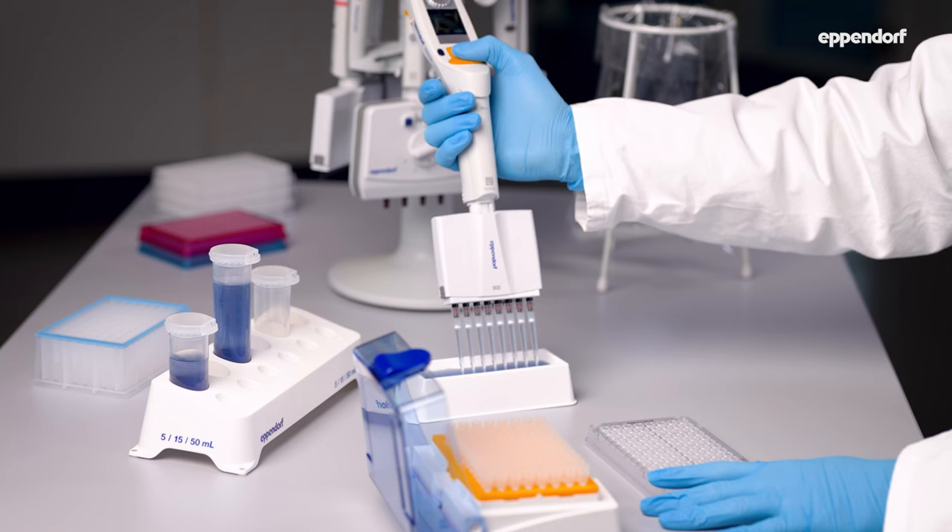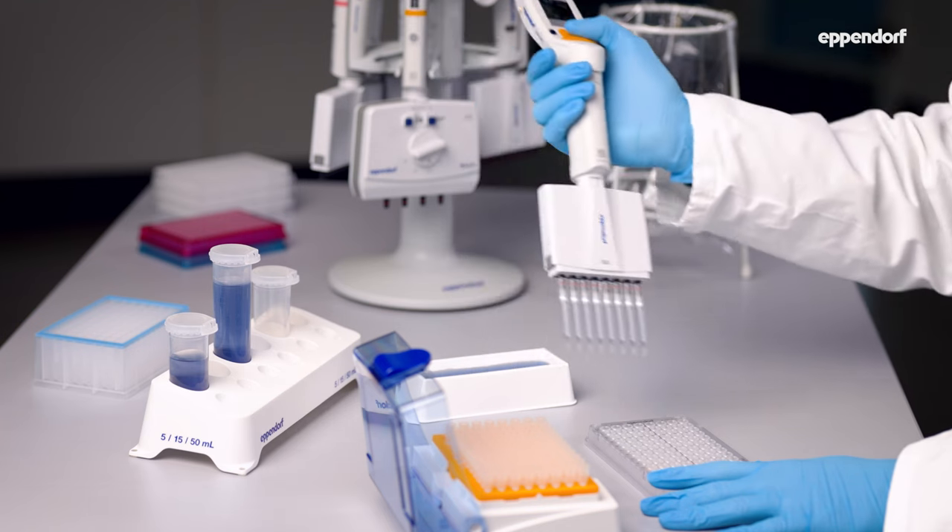Here's a pro tip for electronic multi-channels. Electronic pipettes come with a dispensing or stepper mode which helps you fill plates even faster.